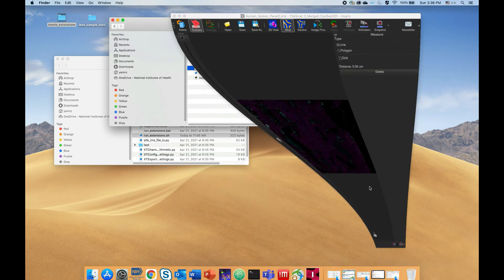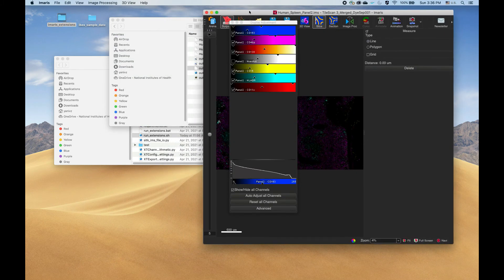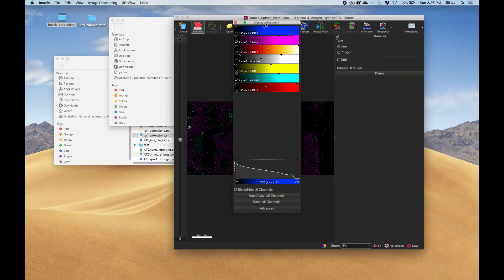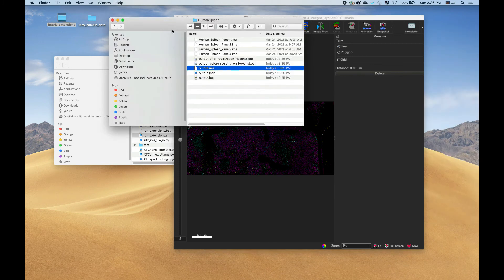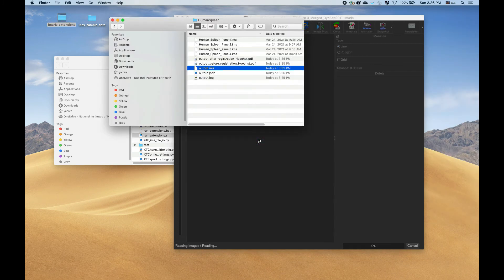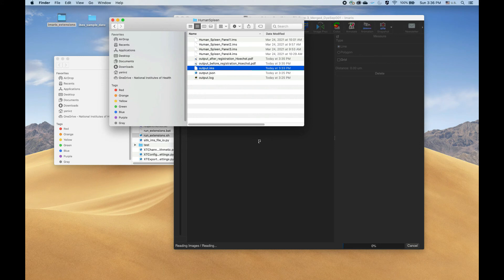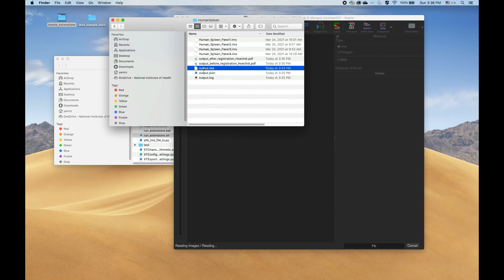Let's open our Imaris here and take a look at that file. It does take a bit of time to read the file the first time that we're opening it because of the way the extension saves it. So after you open it for the first time, save it using Imaris for quick image reading later on. Really this is the result and that's what we're interested in.